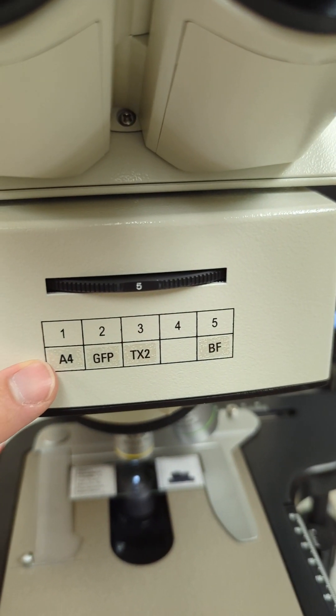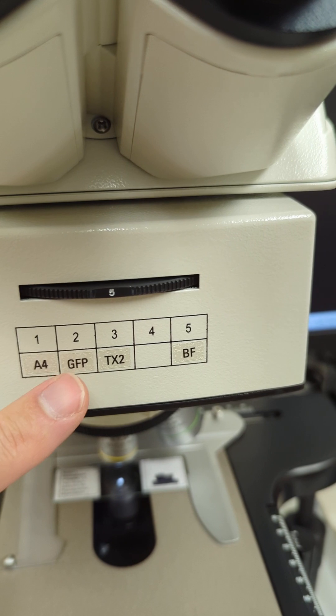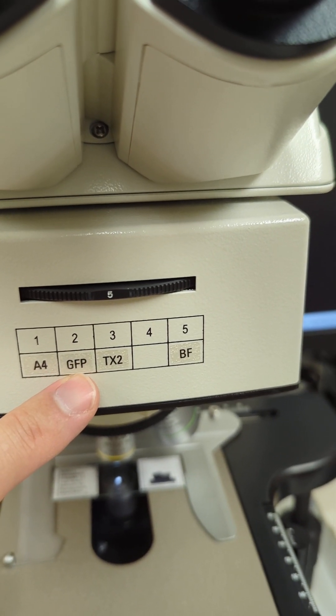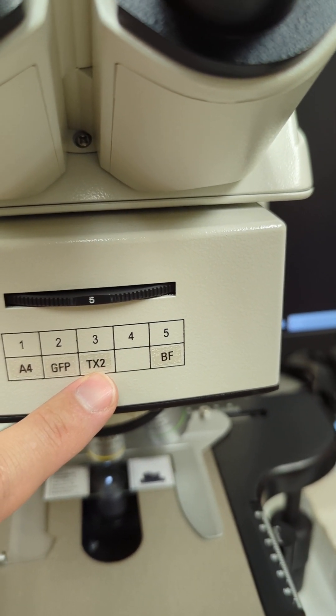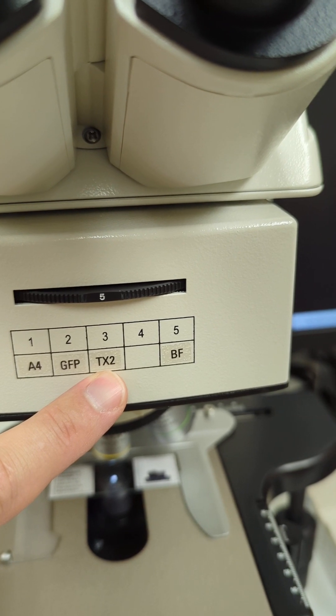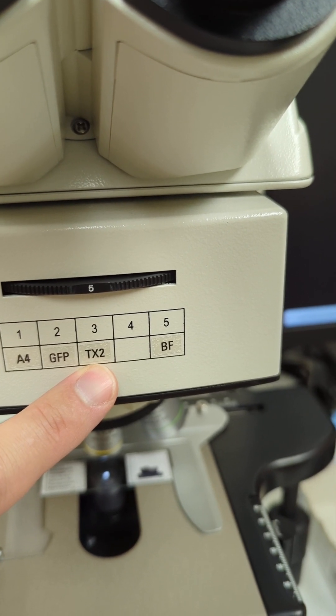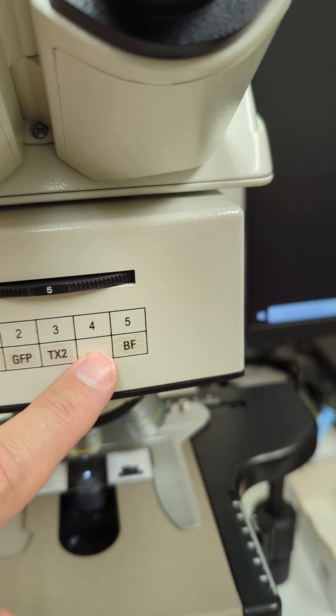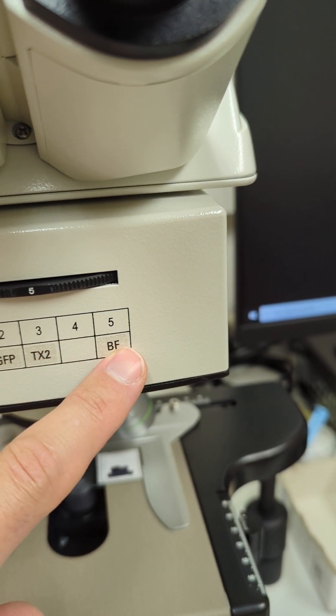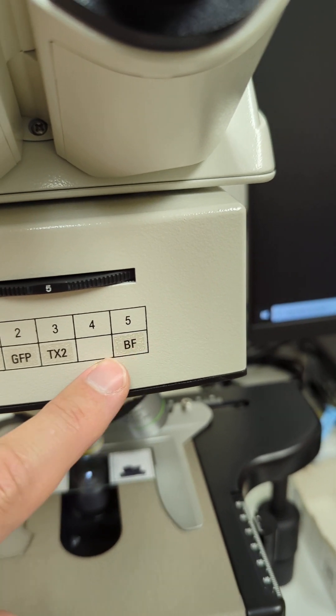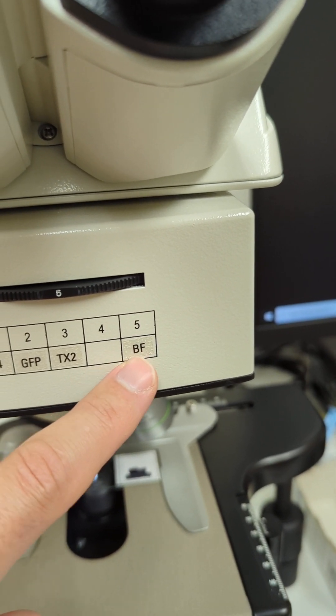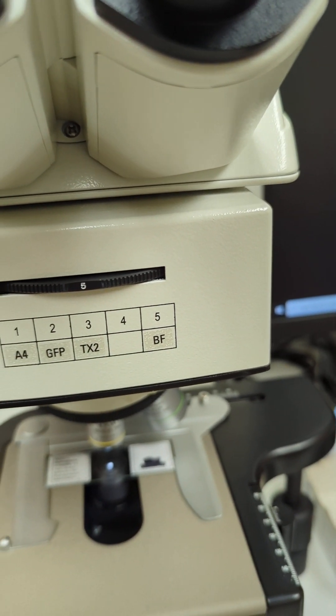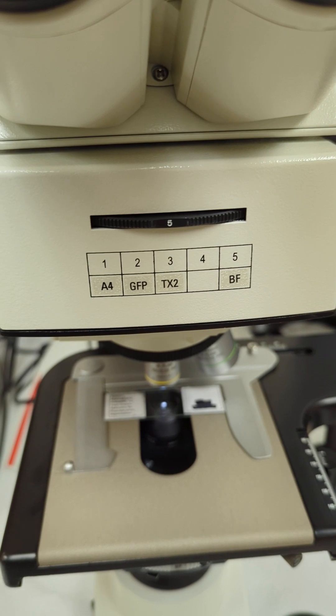DAPI is A4, GFP is GFP green fluorescence, and TX2 is Texas Red. And then this is an empty spot. We call it number five brightfield.